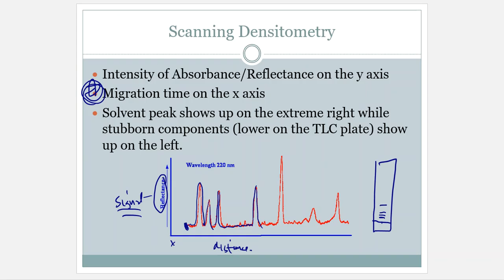And then it saw something, and there is an additional band. That was this one, all right? And then it looks like it goes back down to the flat line for quite a bit. There's nothing there. And then a huge band that shows up and comes back down. So very, very dark, of course. And that's going to be maybe there. Who knows? But this is how that densitogram is going to be comparable to what's happening on a TLC plate.